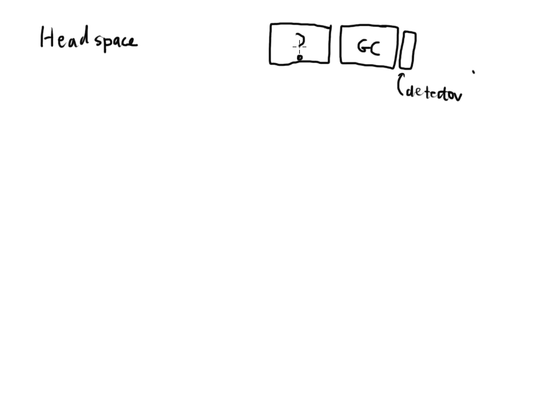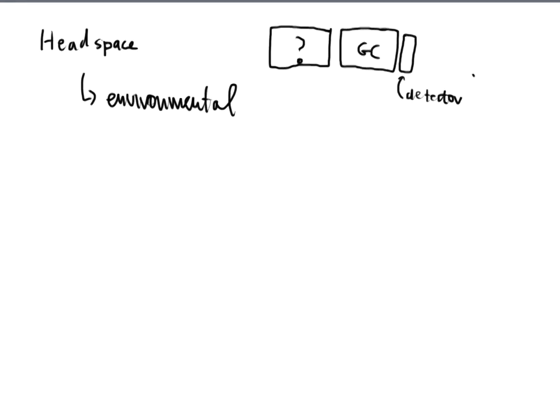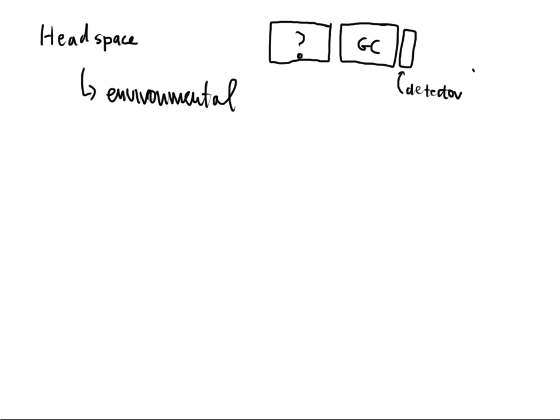What we're focused on here is called Headspace. There are opportunities that you might see out there, especially in an environmental laboratory, that will look at Headspace and use it as the most common way that they perform GC studies. All right, so let's talk about Headspace and really what it means.